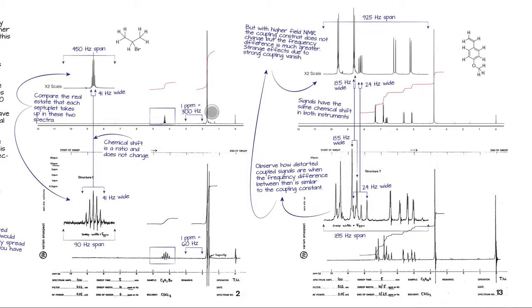Now, that's all nice, but both of these spectra are easily interpretable. But what happens when things get more complicated? Check out this one here, this phenol derivative. The splitting that we see between these 3 non-equivalent protons and this pair of protons and this pair of protons, they're all kind of, well, the aromatic protons are really close to each other, and we have these distortions, plus one set of peaks is on top of another set of peaks here. And that leads to things getting kind of, well, I don't know, what's the word? Complicated. And no one likes complicated.